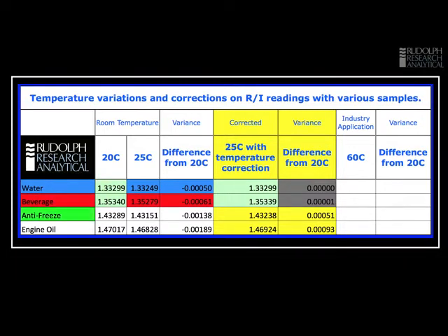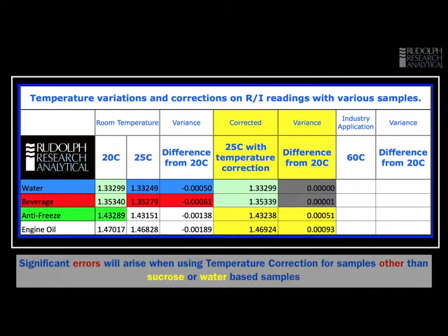The story becomes very different when we move to a chemical — in this case antifreeze or glycol. We have a very large error when measured at 25 degrees; even the small difference between 20 and 25°C gives us variation in the third decimal place. Temperature correction does help, but we're still left with a very large error in the fourth decimal place. The final sample, engine oil, shows the effect even more dramatically: reading at 20 versus 25 degrees gives almost two units difference in the third decimal place. Temperature correction helps a little, but we're still left with an error almost in the third decimal place.